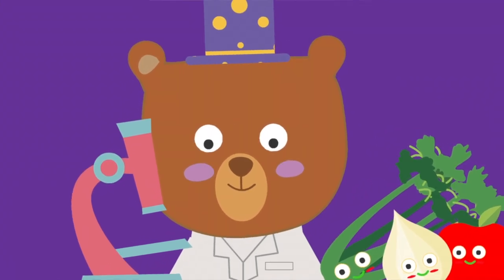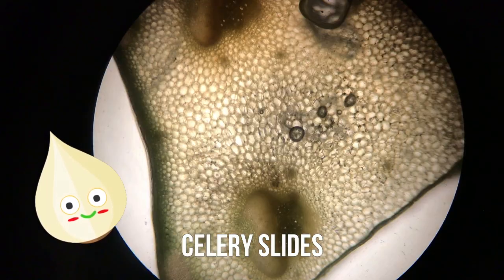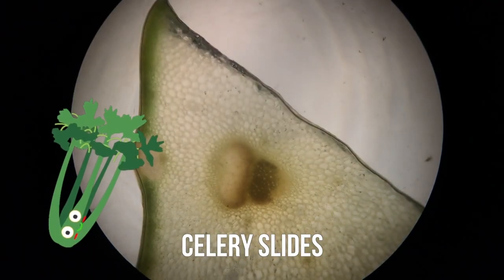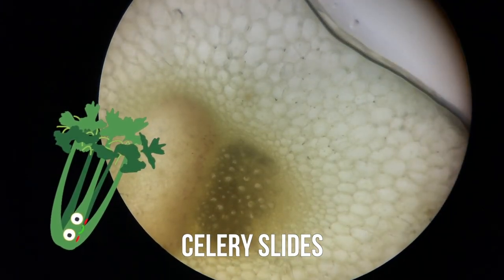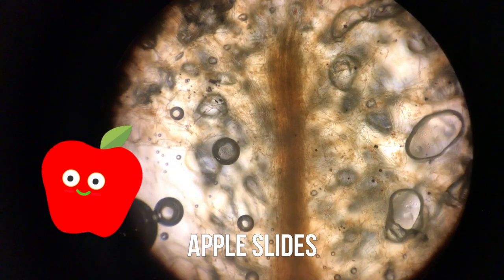Now we have to put them under the microscope. Here are some images from my onion slides. Here are my celery slides. Here are images from my apple slices.